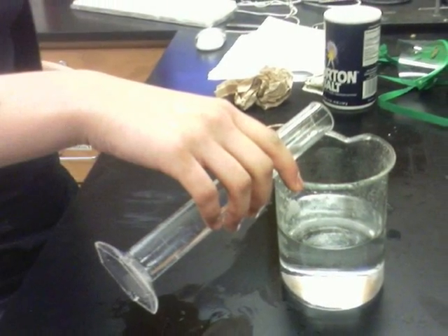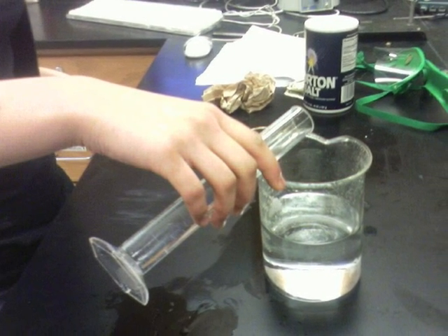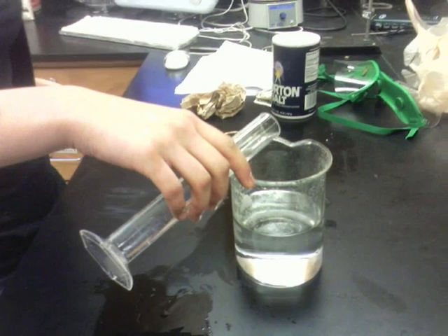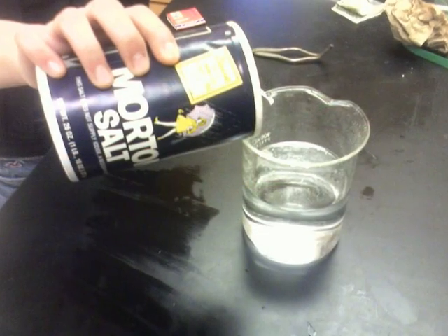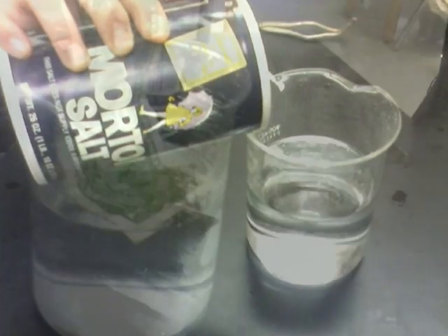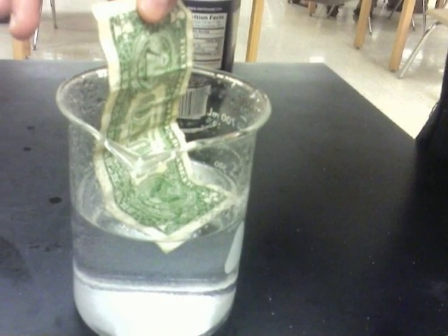Now we're ready to really start the experiment. First, prepare an ethanol and water solution that consists of 50% ethanol and 50% water. Next, add a sprinkle of salt to the solution. Soak the $5 bill in the solution.